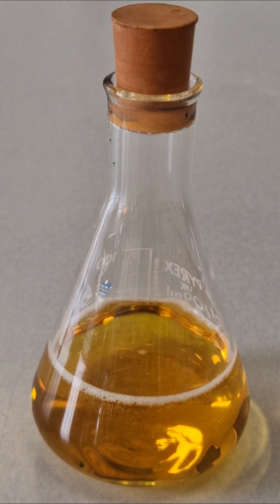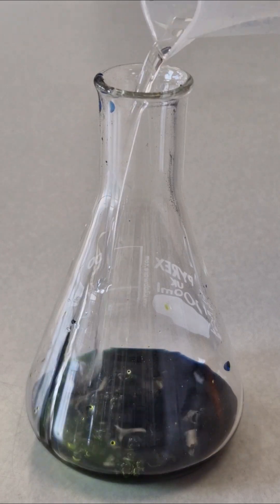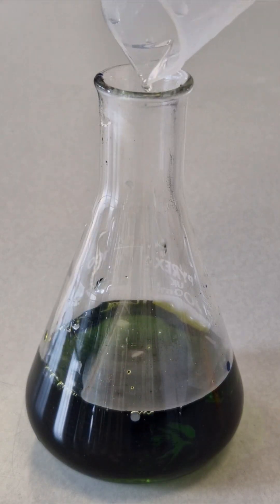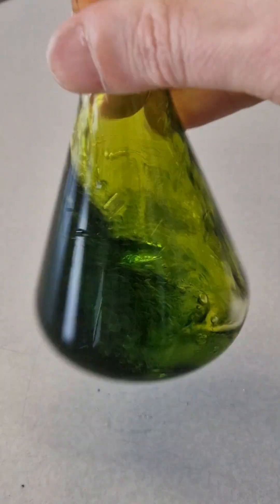Let me show you how to make this solution. Start with a solution of the indicator indigo carmine. Into this we add warm sodium hydroxide alkali solution. We then shake the solution and you can see a green colour has appeared.